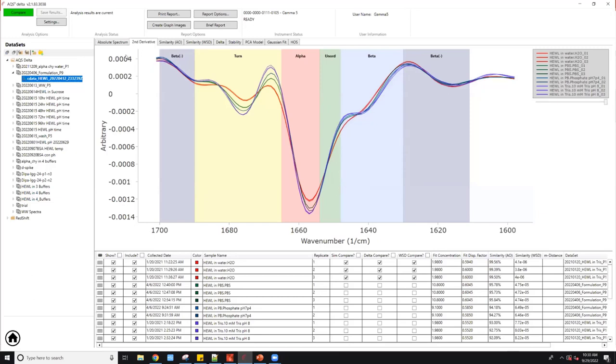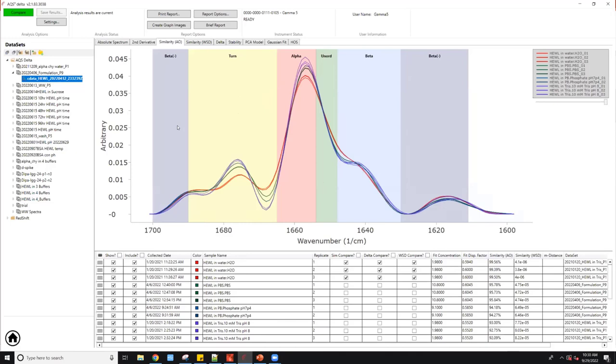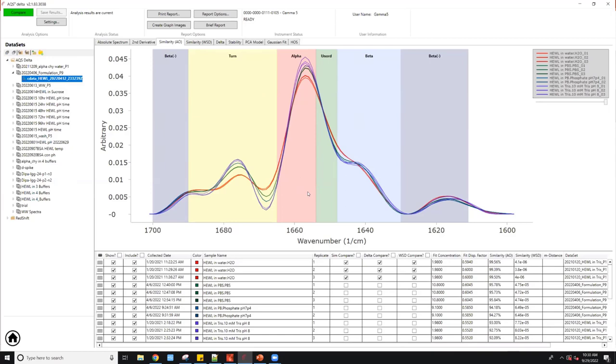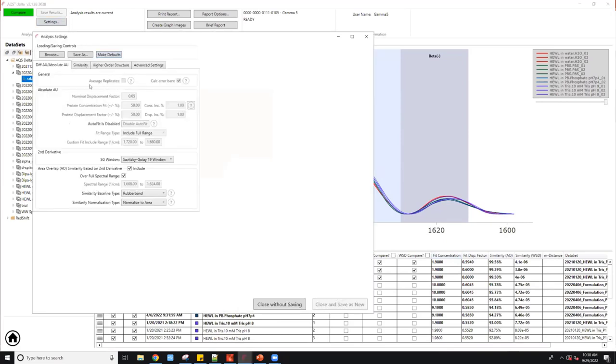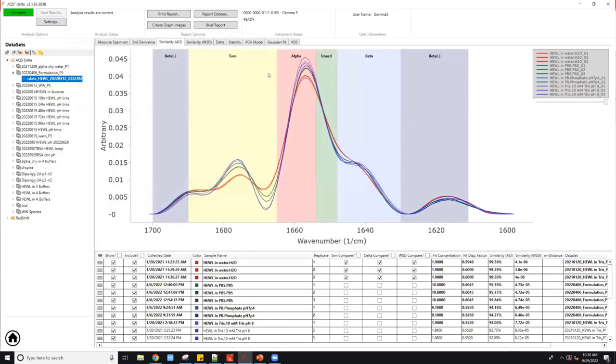From second derivative, what we can do is flip the curves and give it a baseline correction. Now what we have is what we call the similarity plot. From here, you can quantify the overall structural similarities using AOL means area of overlap. Basically the area beneath the curve. We use that to quantify the overall structural similarity or differences. By the way, you can in the settings allow that to average the replicate and calculate error bars, but here I'm just showing the replicates.